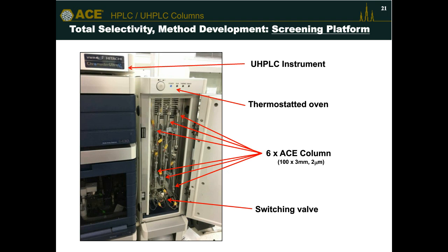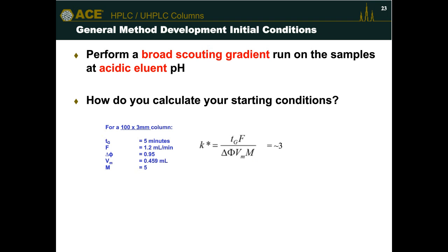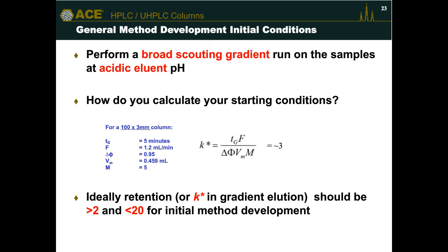Referring back to an answer you provided before, someone asks if you use HPLC equipment with UV and MS as detectors, what would be your recommendation for the scouting gradient method to mimic the profiles presented today? I would have to recalculate it. If you look at the equation that I provided, so if whoever's asked that question wants to download the slides, you can see that all of the conditions I provided are here. So if you're going to increase your column dimensions, say to a 150 by 4.6, 3 micron column, for instance, that would change the VM term, which is on the screen at the moment. Then you just need to solve the equation for the new values to give you the right gradient time and flow rates. It should be a simple calculation.